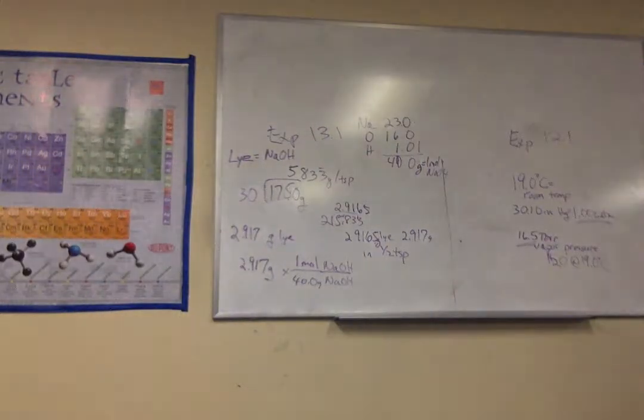0.073. Now, 0.073. Am I right? Yeah, Josh, we have 3 sig figs. That looks right. Okay, good job, Josh. We have 3 sig figs. Yeah, with 366, I had a thermometer. So this is 0.0729.